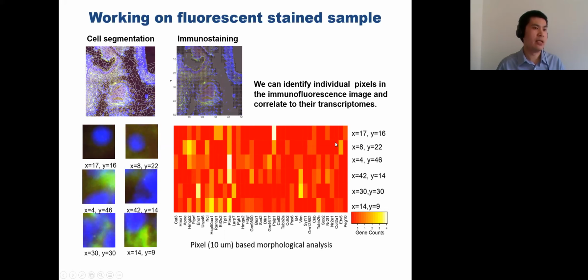Basically, you can analyze their gene expression by comparing the cell morphology or cell counting for each pixel, and you can compare the gene expression side by side.